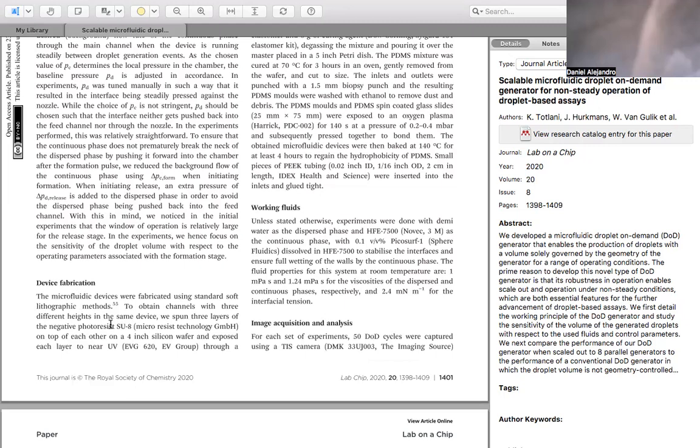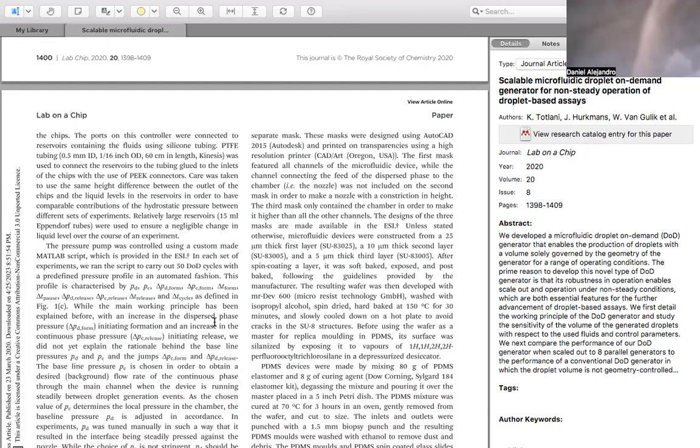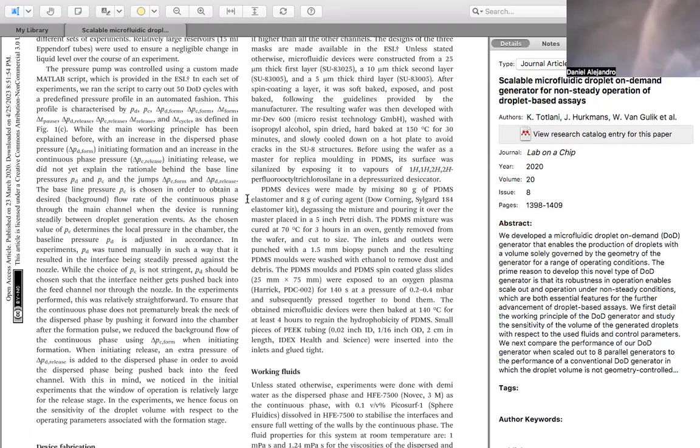For the fabrication, they use lithography, and they use three treatments to obtain three layers. These three layers are made with three different steps. We can do that, but we have the problem that the flex is not that sensible to the lithography plates, but we can try it. The PDMS mold is the same fabrication, the same experience that we have.